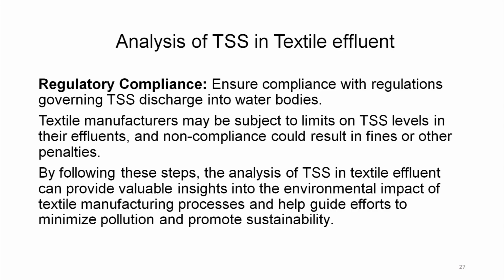Regulatory compliance. Ensure compliance with regulation governing TSS discharge into water bodies. Textile manufacturers may be subject to limits of TSS levels in their effluent, and non-compliance could result in fines or other penalties. By following these steps, the analysis of TSS in textile effluent can provide valuable insights into the environmental impact of textile manufacturing processes and help guide efforts to minimize pollution and promote sustainability.